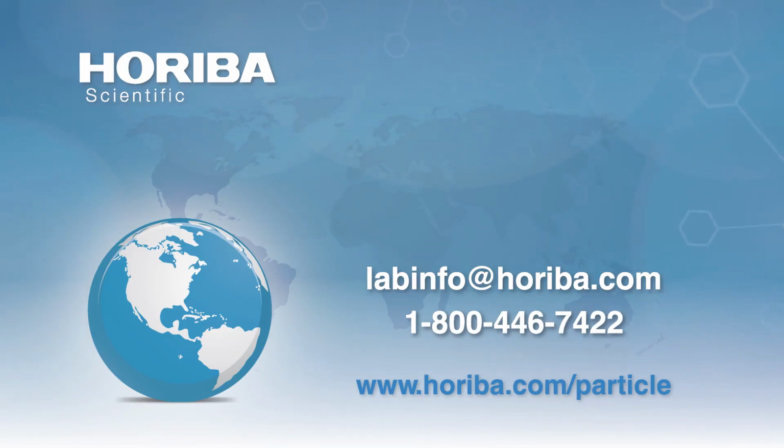I do not see MANTA, multispectral nanoparticle tracking analysis, working here, as it always requires Brownian motion, and that can happen only when you have a molecule in aqueous solution and they don't interact with the material of the cuvette and among themselves. But for powder form, I would encourage using laser diffraction from HORIBA again. That's an excellent tool to be utilized.